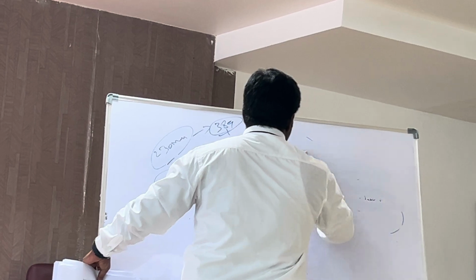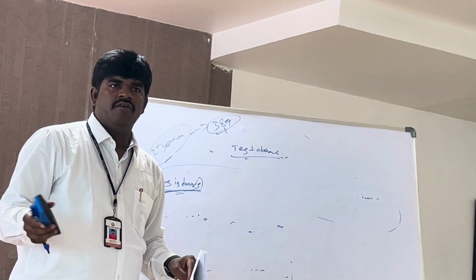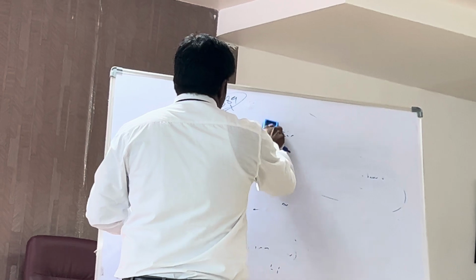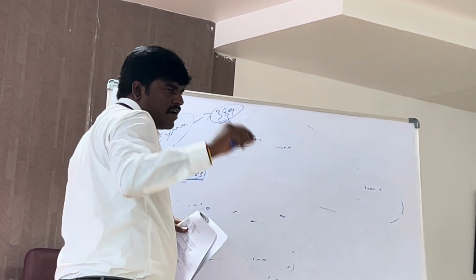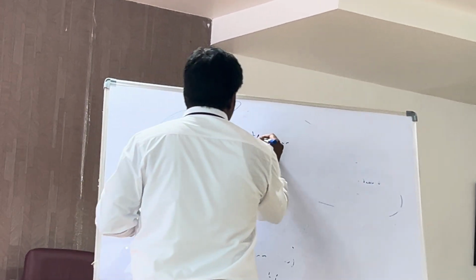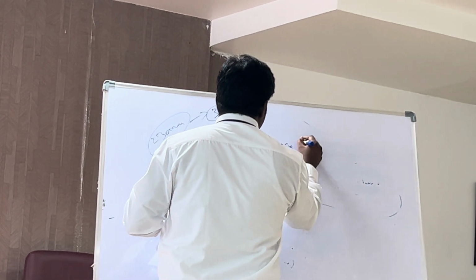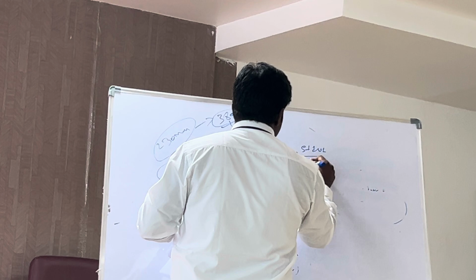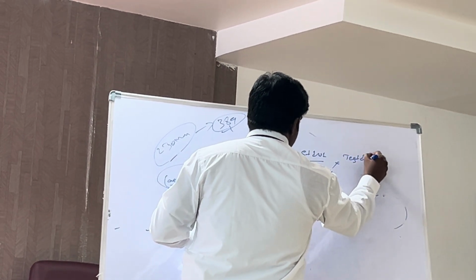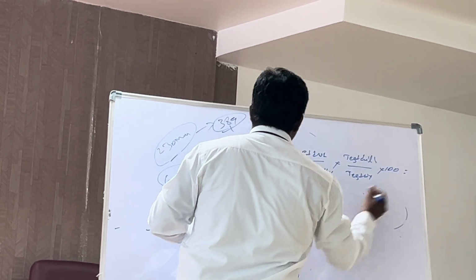If it is API, it doesn't include any average weight, it doesn't include any other thing. So simply you need to mention test area. Normally in chromatography we inject something, and whatever number you are getting is the chromatography area. So test area divided by standard area, into standard weight divided by standard dilution, into test dilution divided by test weight, into 100. You will get the API.